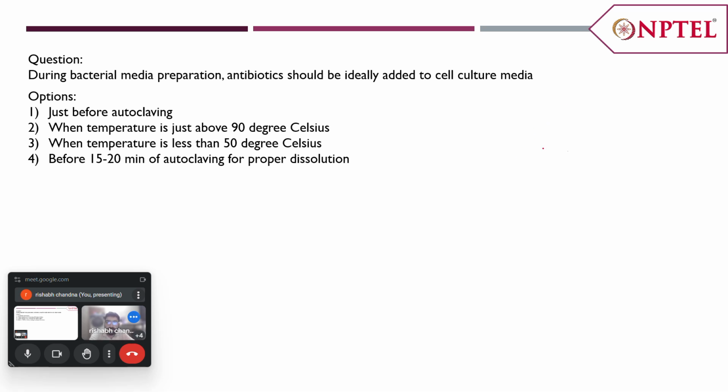In case of bacterial media preparation, what we generally do is take a flask, for example a conical flask that we use for culturing bacteria, add water and directly add media to it.